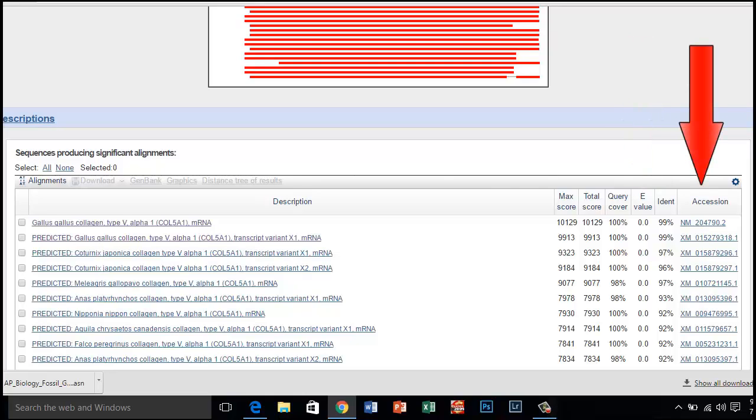These links refer to related entries in other BLAST databases. They are not used at this particular time.